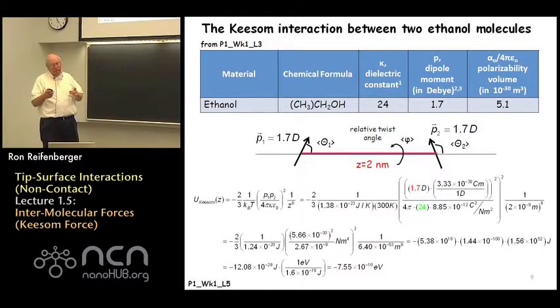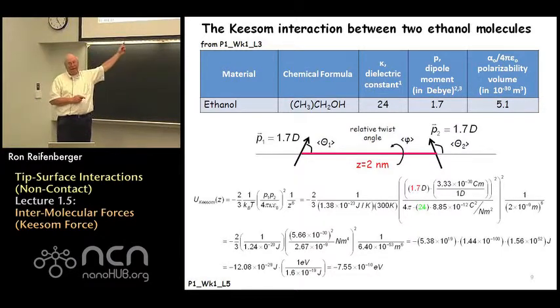So any interaction that we've already considered previously would dominate this particular interaction, but all the other prior interactions involved interactions between a point charge and a dipole moment, basically. And if you don't have point charges floating around, then all those other interactions go to 0, and this becomes the dominant one.